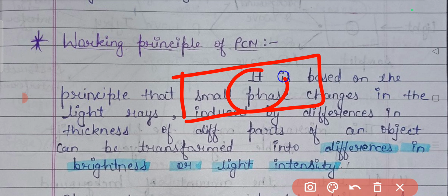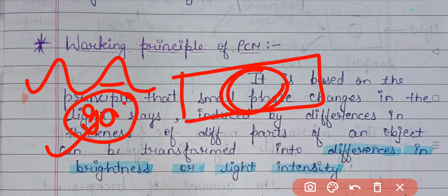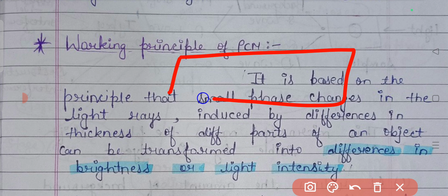The phase contrast microscope has a structure, as we discussed earlier, that is the phase shift ring. The phase shift ring shifts the wavelength by 90 degrees so that we will not be able to visualize the background light. This is the specimen, and there will be two types of waves generated here.